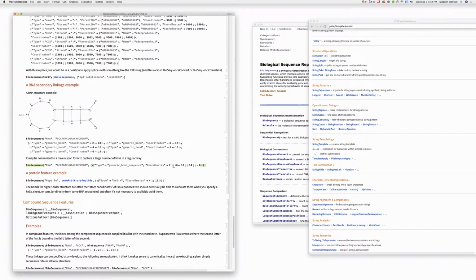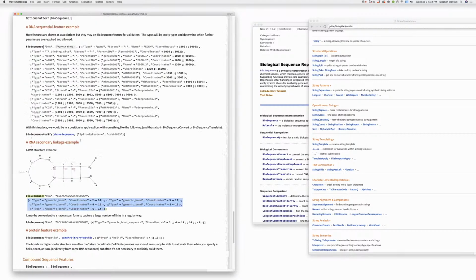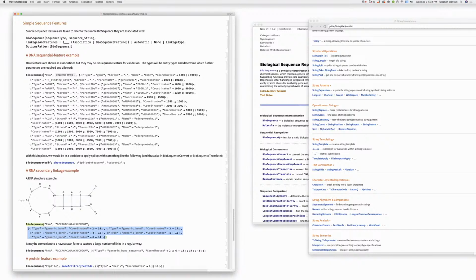Okay, all right. So basically, what you don't have the capability to do is to annotate in sequence, so to speak. This is externally annotated. That's the first example there, annotating some exons and coding sequences. The very first one is doing some annotation. But the point that I'm making is it is externally annotated.